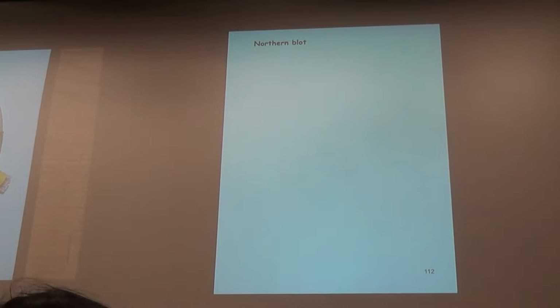And so you do the experiment more or less the same, not exactly the same, but more or less the same. This is a rapid method that allows you to determine the cell type in which a specific gene is active and being transcribed.